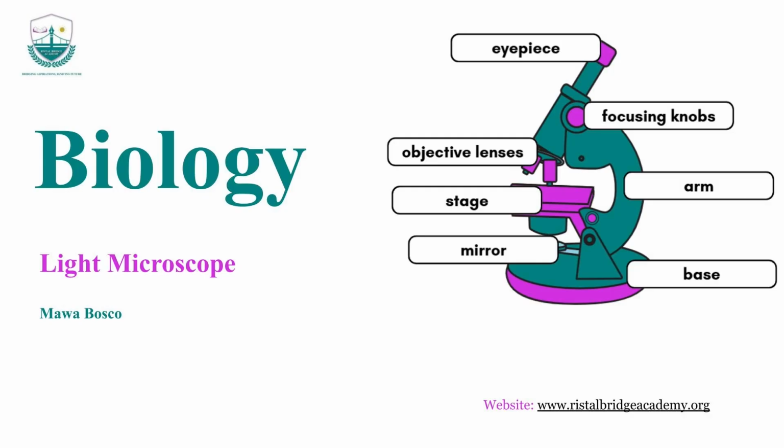or another equipment that we can use to see small things that we couldn't be able to see with the naked eye or even with the hand lens. So that means that we are now moving to more advanced machines that can be able to help us to see things in detail. And in here, we are basically looking at the microscope. And in this session, we are going to see the types of microscopes that we have.